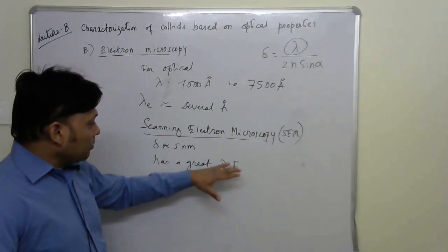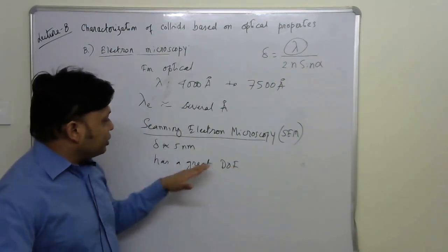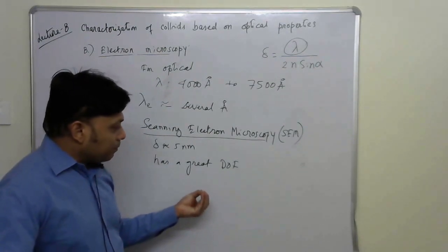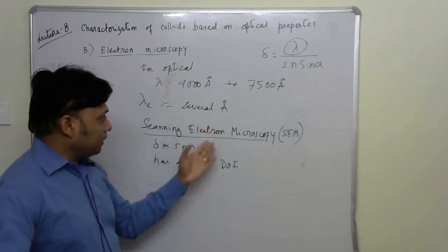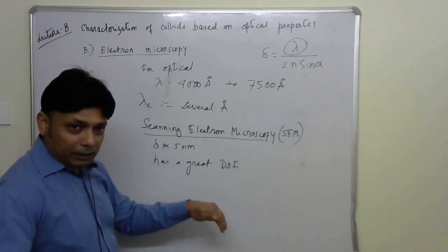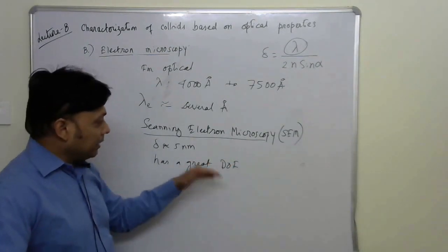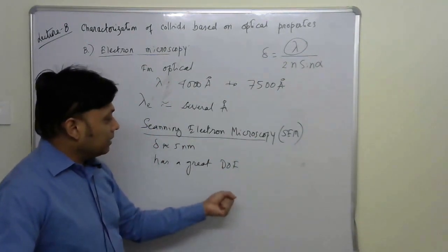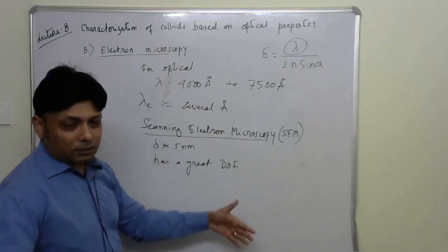But I can tell you one very basic thing: the image that is generated in SEM is actually from some electrons that are coming back from the samples to the detector. But in TEM, we actually observe the beam directly after it has interacted with the sample. In SEM we see some electrons, called secondary electrons, that are mainly generated after this electron beam interacts with the samples.